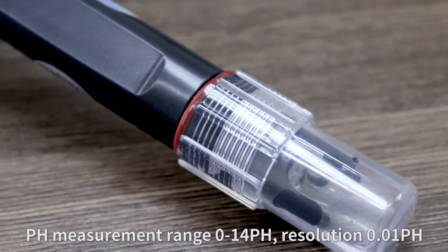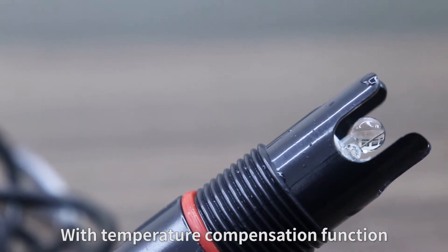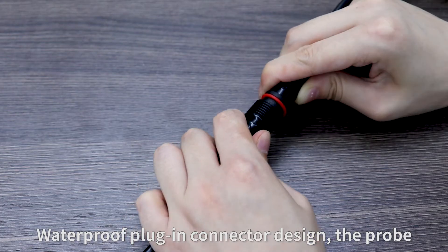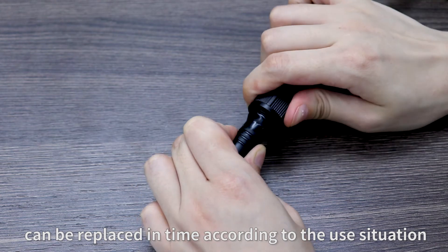The pH measurement range is 0–14 pH, with a resolution of 0.01 pH. It includes a temperature compensation function for more accurate measurements. The waterproof plug-in connector design allows the probe to be replaced as needed based on usage conditions.